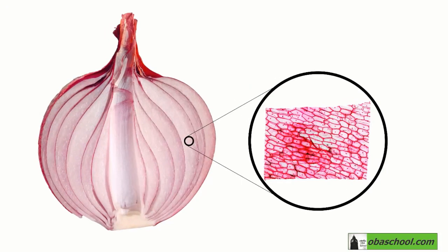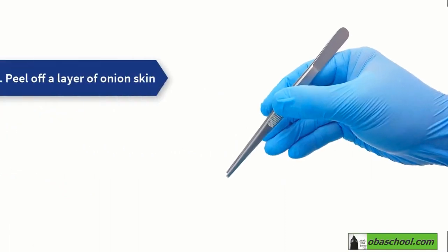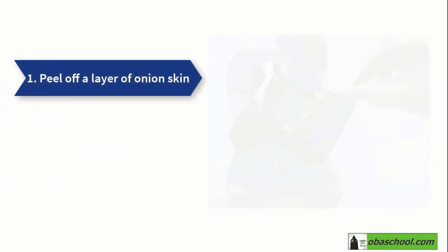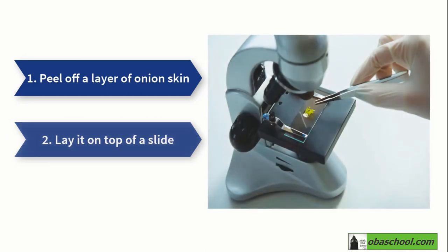To view plant cells, for instance onion cells, we use tweezers to peel a layer of the onion skin and lay it on top of a slide.